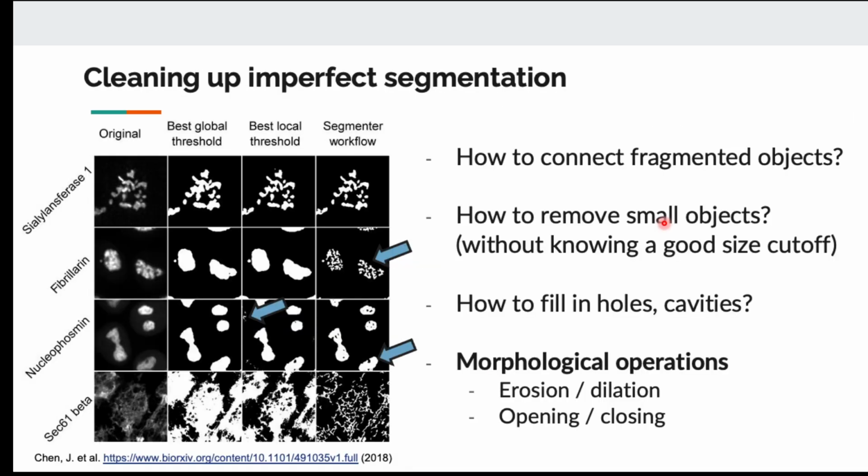Okay. But sometimes, using these types of algorithms, you're not going to get a perfect boundary or perfect positioning of the cell, of the nucleus. Sometimes, because the fluorescence signal can be very spotty, no matter how you try to threshold or fix them, you still see spotty signal.